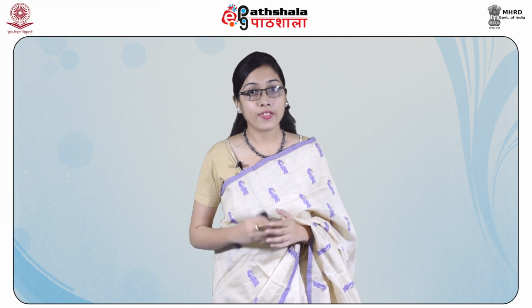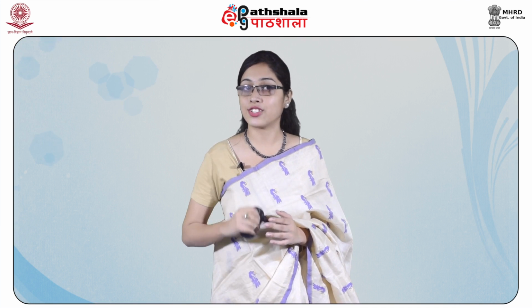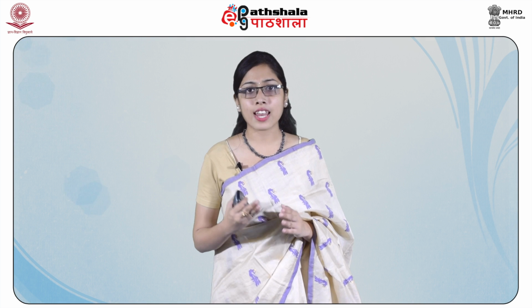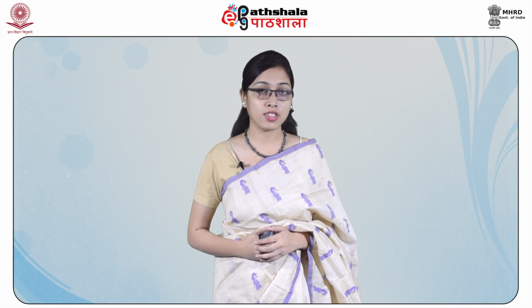Chromatographic separation involves a stationary and a mobile phase. The analyte mixture interacts with the stationary phase. Depending upon different types of interactive forces of components of the mixture with the stationary and the mobile phases, some molecules are detained in the column more than the others. The difference in the migration rate of the components of the mixture brings about the separation as the mobile phase moves and flows out of the system. The mobile phase can be either liquid or gas. The stationary phase can be solid or liquid.